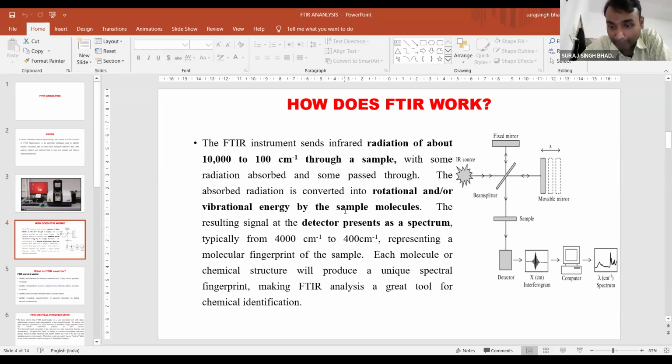So basically, suppose you take any sample under this type of spectroscopy. Through this analysis, our samples possess various types of molecules, and through these molecules the energy and the light, the IR from this spectroscopy, is getting absorbed, and these particular molecules are working at a certain intensity and wavelength.